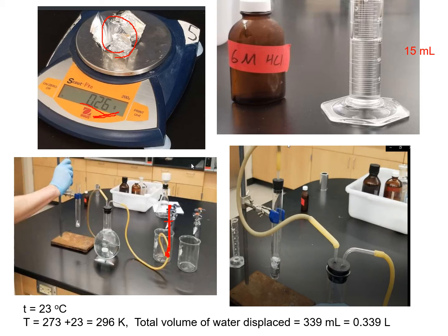All right. So this 6 molar HCl is already given here. You need to put this 6 M HCl in a measuring cylinder, and it's about 15 milliliter. This number is an approximate number. It can be 15.1, 15.2, a little less, a little more. It can be any number. You don't need this number later in calculation. But 0.26 is a required number, or you may get 0.25 gram, 0.27 gram, 0.29 gram, whatever you get, you must record this number in your notebook. You really don't have to record this 15 ml.